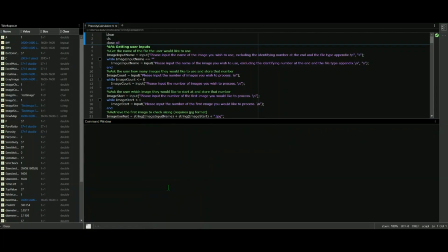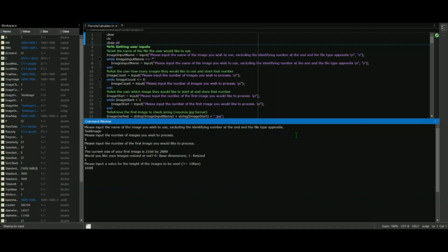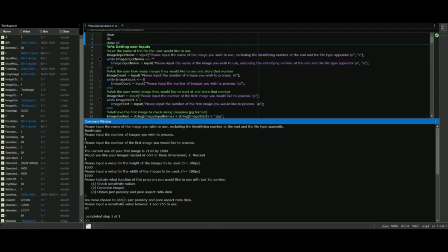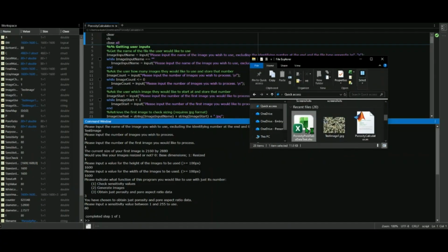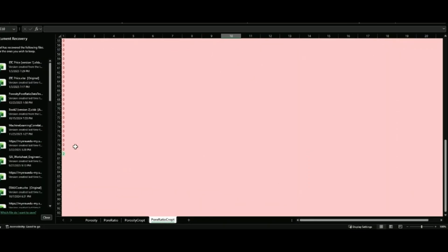Okay, so we're going to now go through the very last, and we will fast forward again. Again, we're using the same value for resizing the image, and then we're just going to obtain the data. Now, because we've already chosen 52 to 57, I want to show a different one. We're going to go to, let's say, 80. Let's try 80. Again, very quick because it does not require a lot of computation. And because this was cropped, it should be over here.